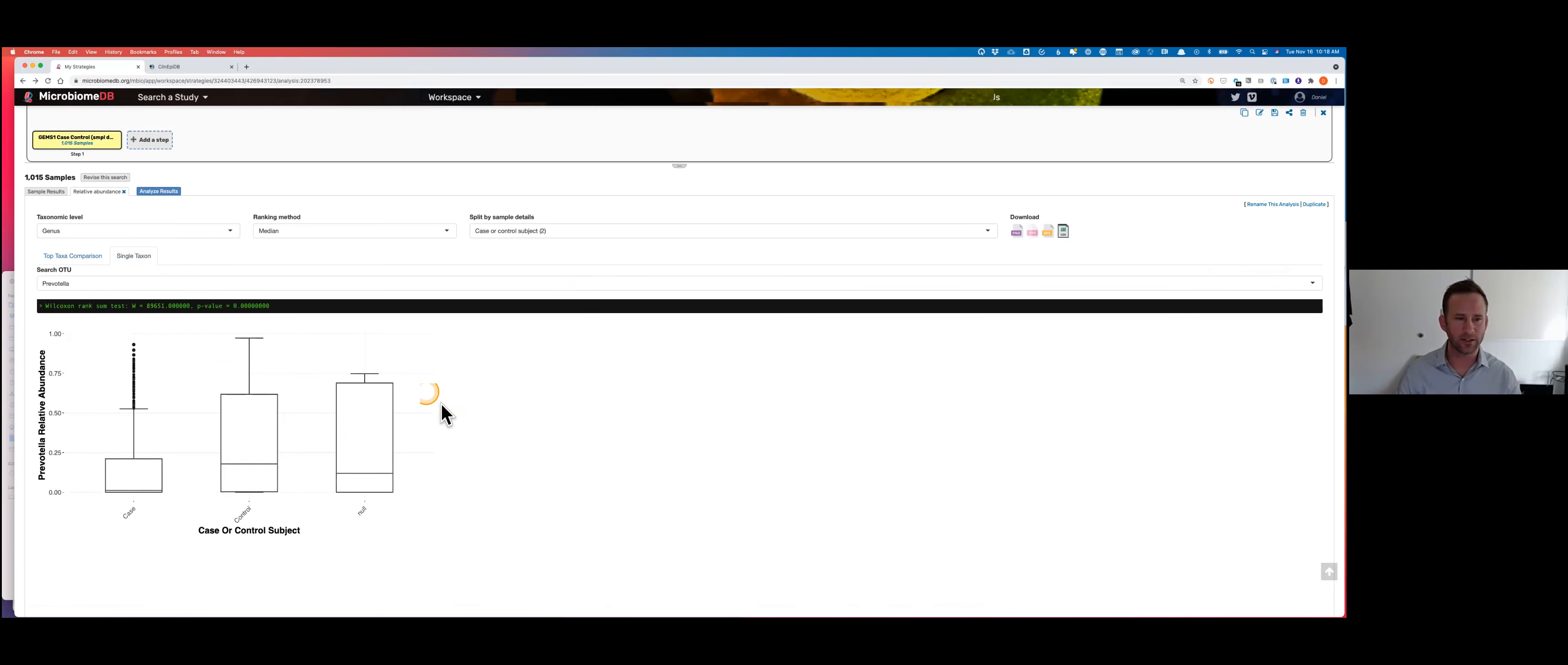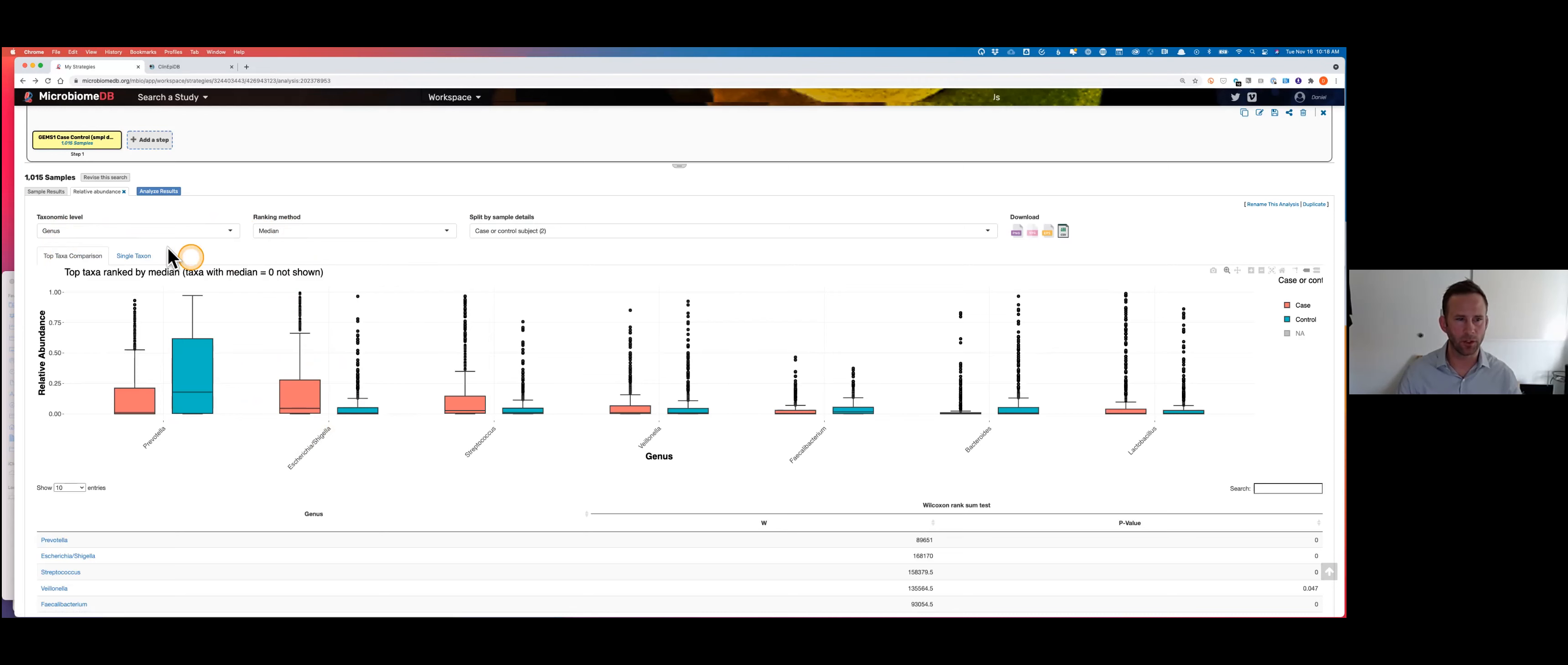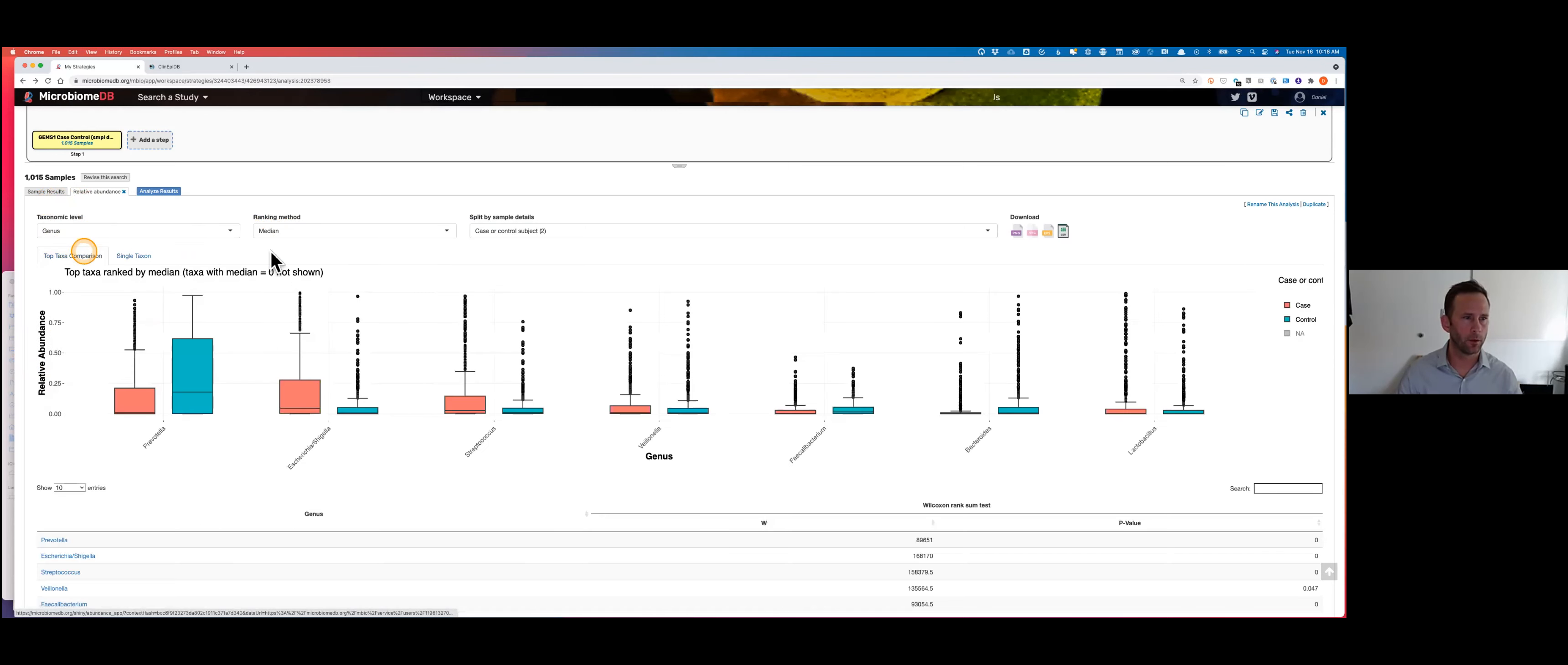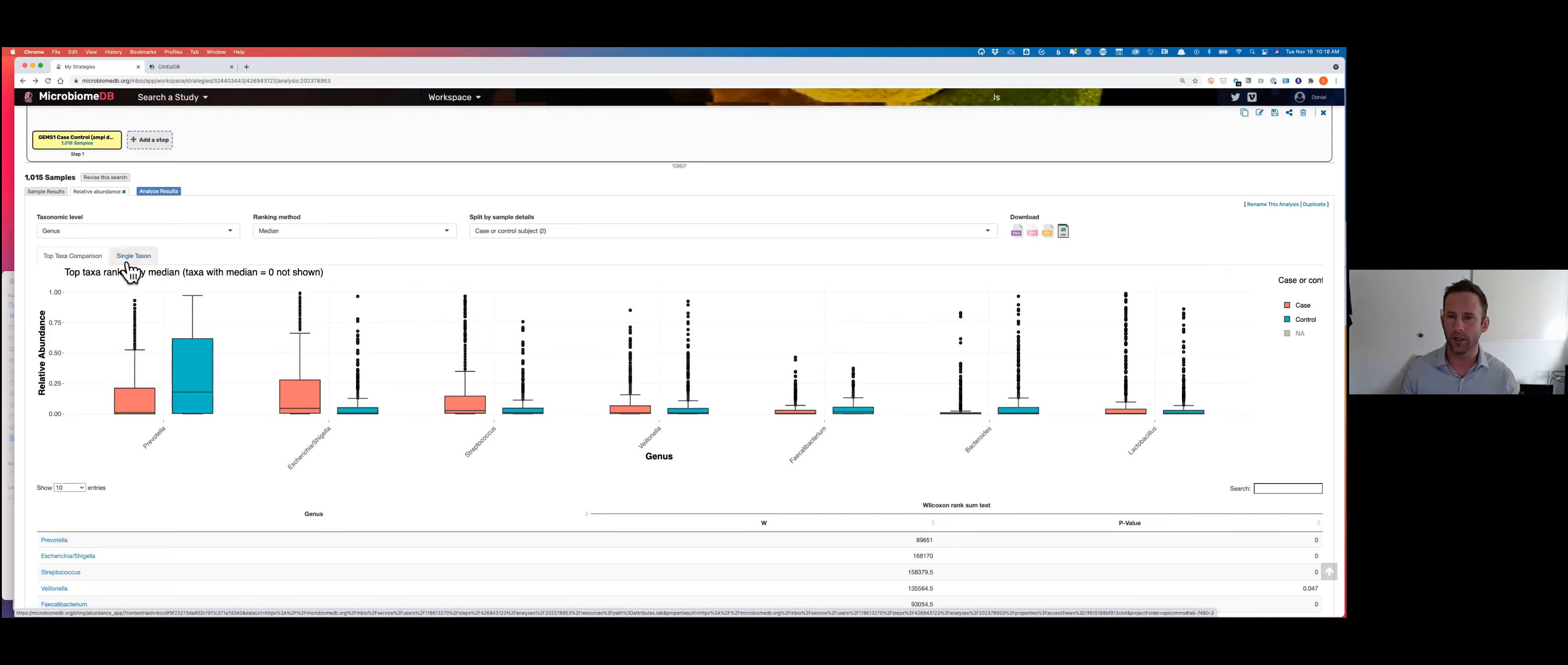It would help to do this by some other metric other than just me eyeballing things. Once I've zeroed in on a few taxa that look different, like E. coli-Shigella or Prevotella, I can explore those a bit more in the single taxon tab. I can see that indeed there is a highly significant difference, a p-value of zero really, that these cases and controls are different from each other. I could do the same with E. coli-Shigella. Highly significant by a Wilcoxon rank sum test. Very quickly, I took a thousand samples, split them by case and control, identified trends and differences in the microbiome, and was able to look at statistical significance all within a single data visualization app.